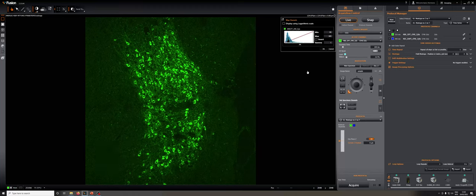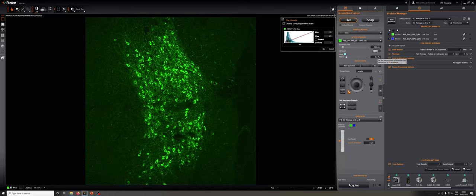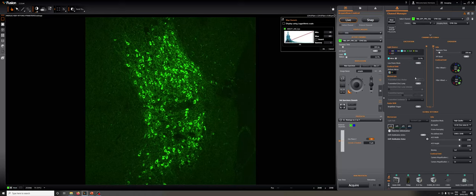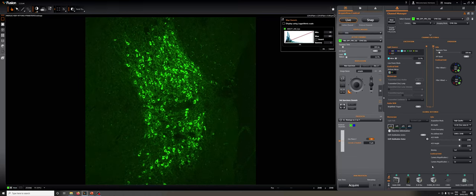What's next is to adjust the channel settings. We can adjust some basic ones by adjusting the exposure and laser power here. If we want to make more sophisticated adjustments, we need to go to the channel manager, where we have the ability to access lower laser powers by turning on the low laser power mode, as well as more complex settings related to cropping and binning.